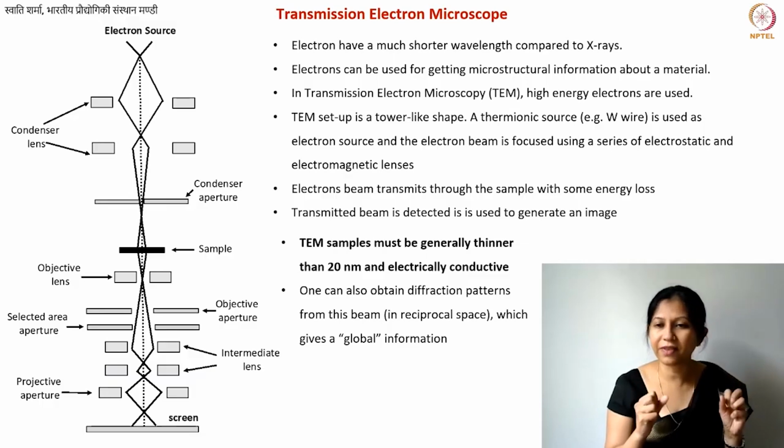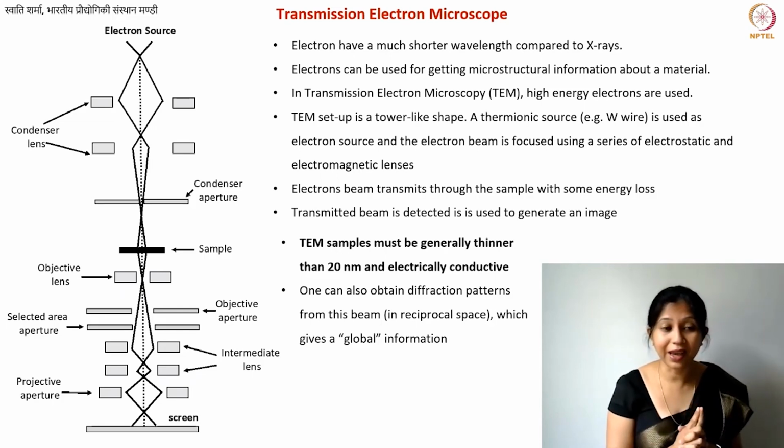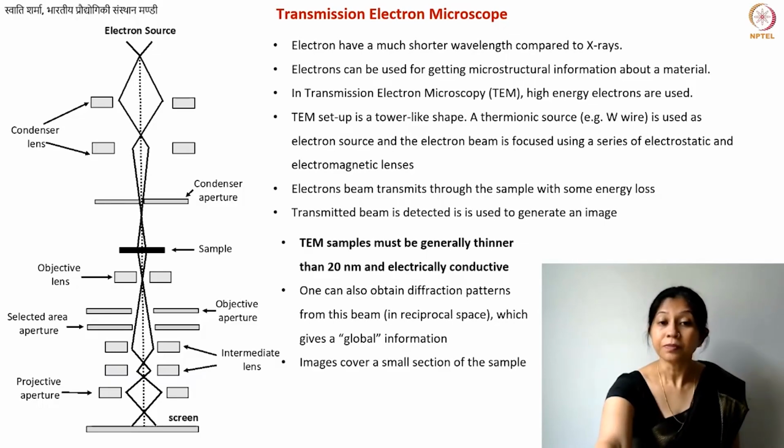It does not help us very much with non-graphitizing carbons. So again, we are going to discuss that. Non-graphitizing carbons, you know that they are turbostratically arranged and their sheets contain defects and so on. In that case, what is missing is the 3D crystal structure. So we have crystals in 2D, but 3D arrangement is missing. And whenever the 3D arrangement is missing, it becomes very difficult. Even with XRD, it is difficult. But potentially you can get electron diffraction patterns as well using your transmission electron microscope.